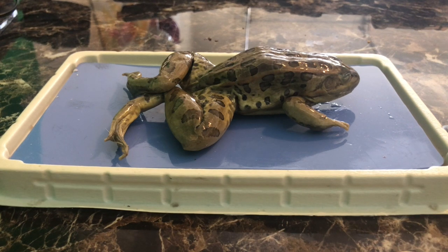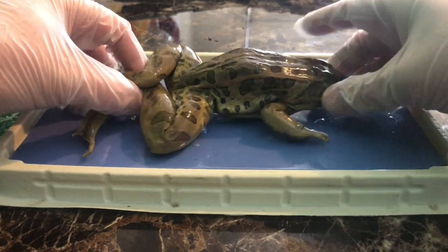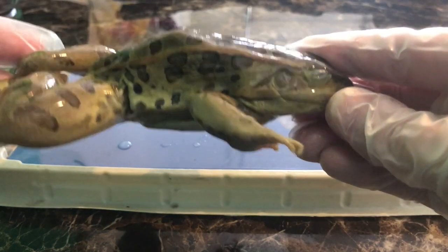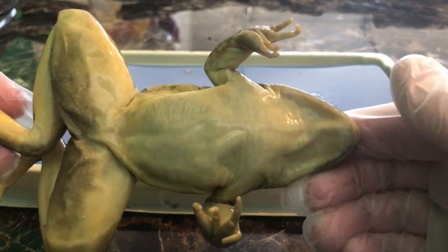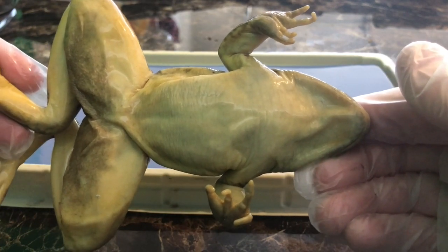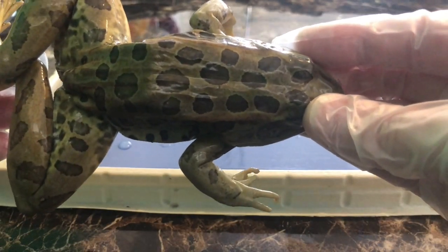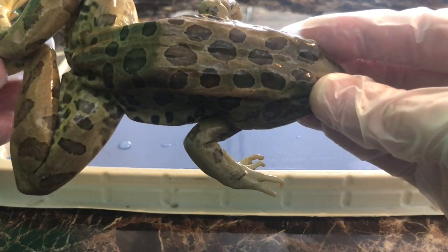We're going to start with the frog dissection focusing on the dorsal and ventral sides of the frog. If you take a look at the dorsal side, which is the top or back area, you can see the patterns and colors. Here's the dorsal side, here's the lateral side, and here's the ventral side. The ventral side is very light — more of a light green or yellow — while the dorsal is very dark green, almost blackish in spots.